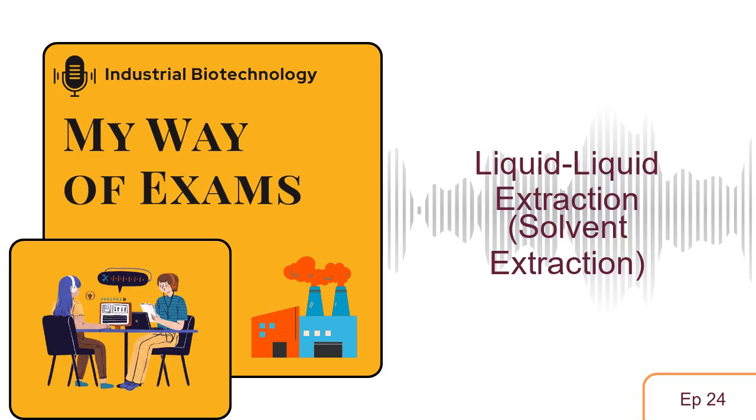Okay. So to sum it up, LLE is all about using these liquids that don't play nice, immiscible liquids, to pull out what you want. It all comes down to how soluble it is in different liquids. And the key is picking and recovering your solvent wisely. You got it. If we zoom out and look at the bigger picture, think about purification. It's the foundation of so many industries, from making life-saving medications to producing the food we eat. And LLE is a foundational tool to make all that happen.